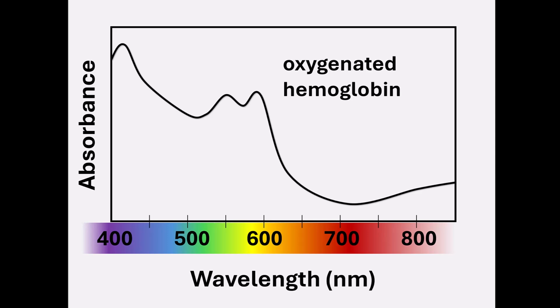The second issue to consider is tissue absorbance of light. Oxygenated hemoglobin will absorb visible light most strongly at wavelengths below 600 nanometers. This will serve as a major impediment to light transmission through tissues. In our experimental model, we will image agents that absorb and emit in the far red region of the visible spectrum, so interference from hemoglobin absorption will be minimized.